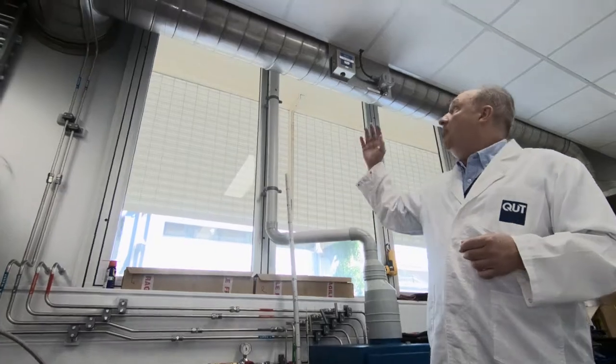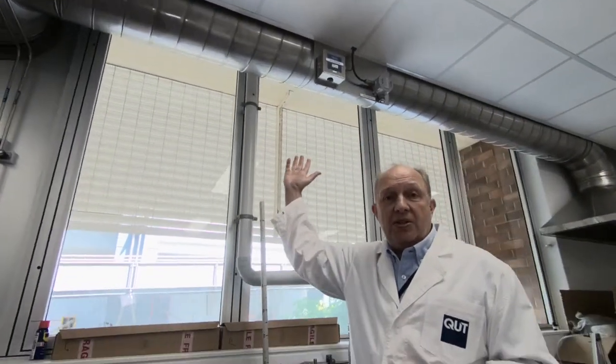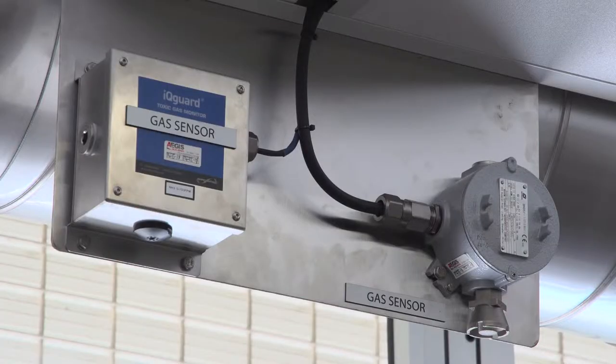And last but not least, we have a gas sensing system. In case of any leakage of these dangerous gases, the system will be automatically shut down.